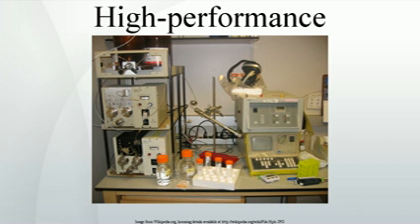Separation factor, alpha, is a relative comparison of how well two neighboring components of the mixture were separated, that is, two neighboring bands on a chromatogram. This factor is defined in terms of a ratio of the retention factors of a pair of neighboring chromatogram peaks, and may also be corrected for by the void volume of the column. The greater the separation factor value is over 1.0, the better the separation, until about 2.0, beyond which an HPLC method is probably not needed for separation.